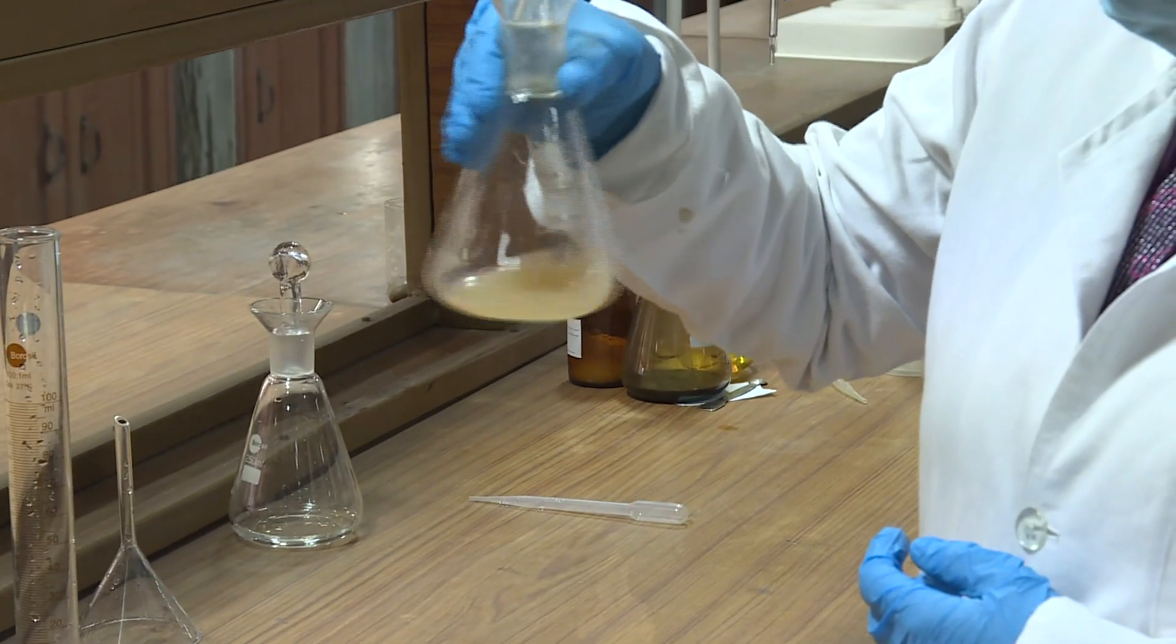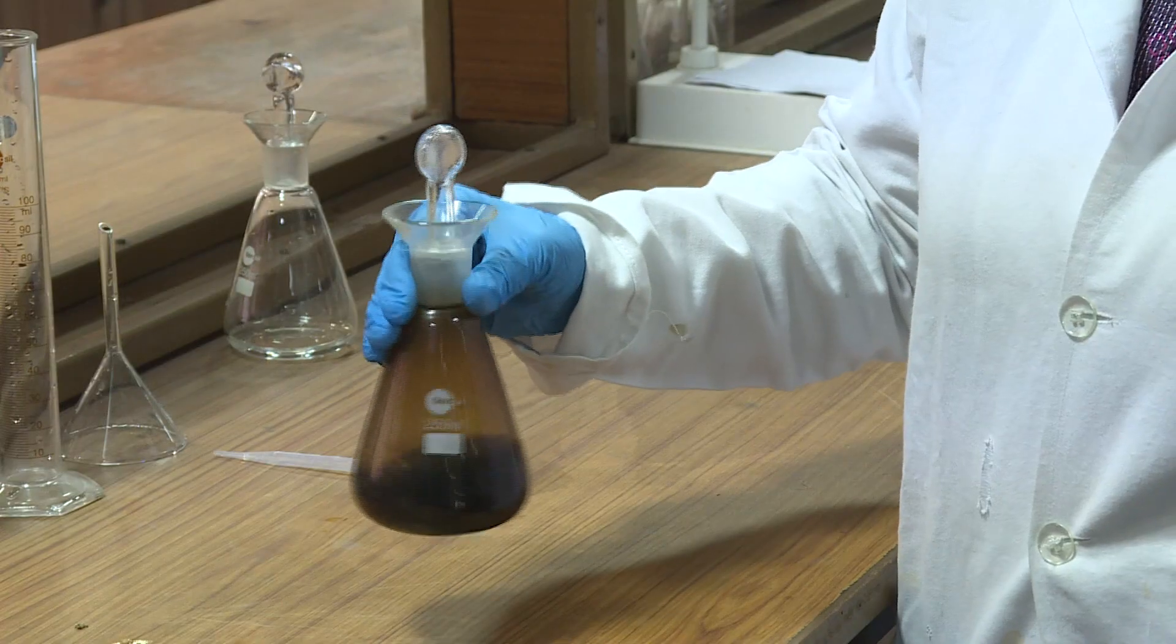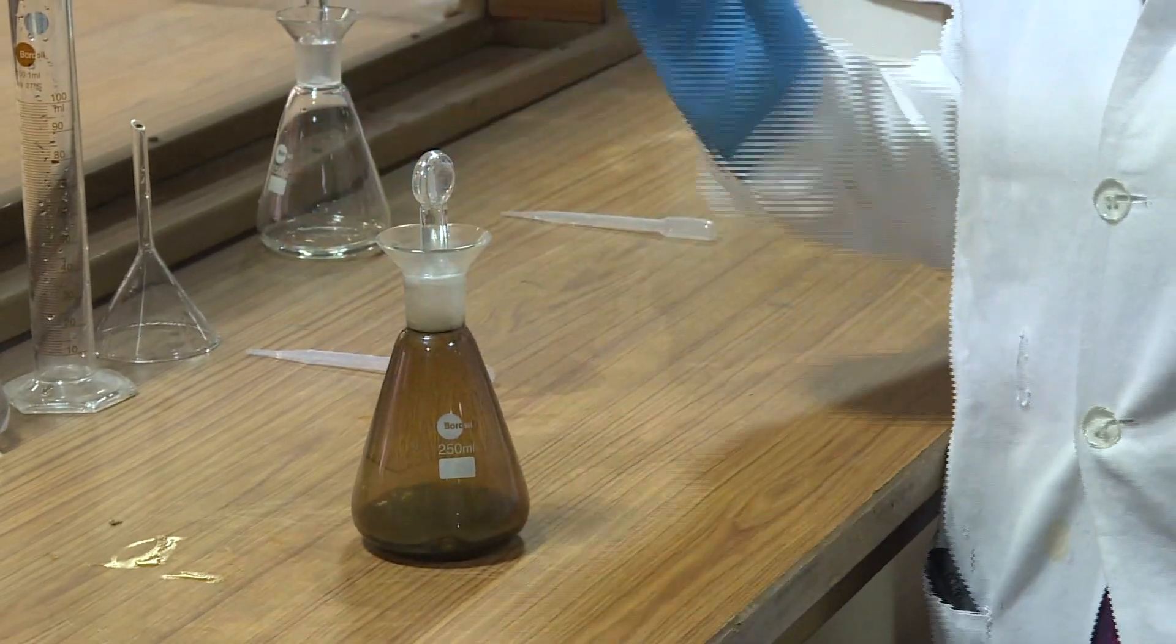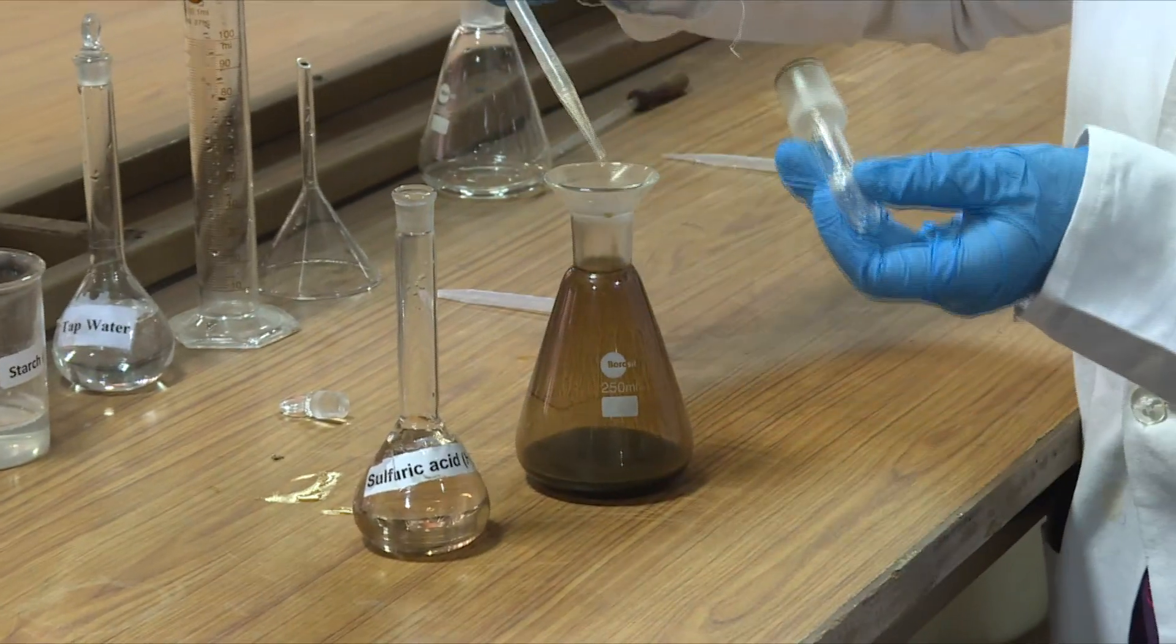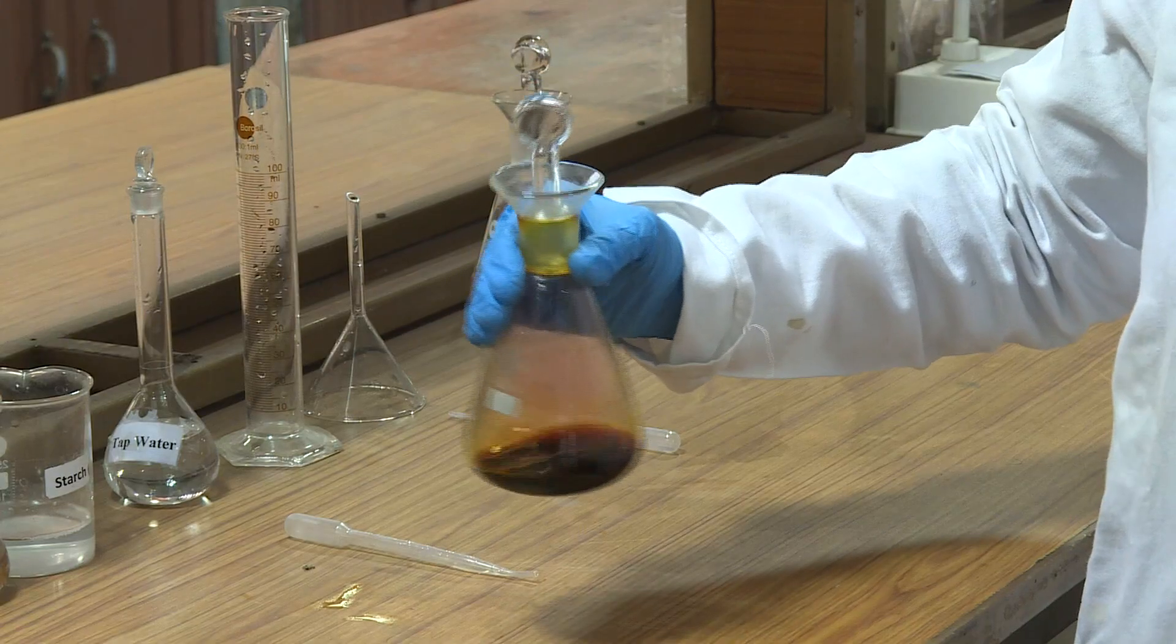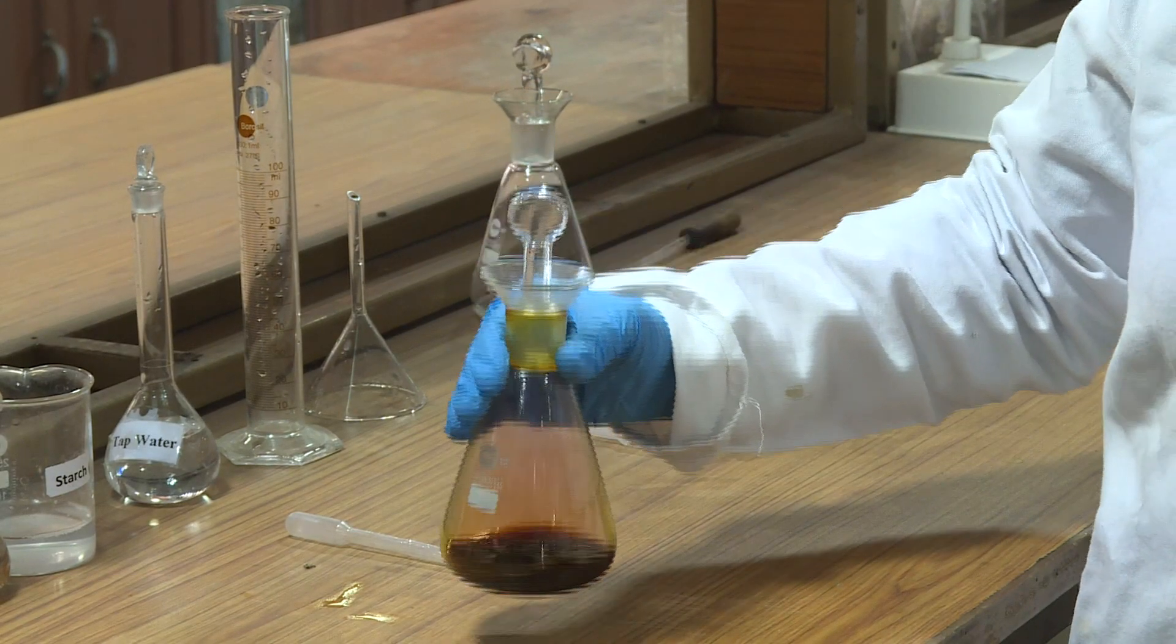Repeat this process of shaking and settling at least three times. Add 1 ml of concentrated sulfuric acid, insert the stopper, and shake again. Allow the dark brown solution to stand for 5 minutes.